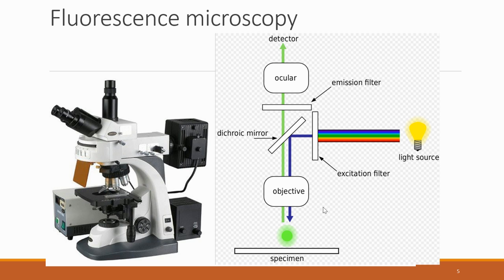There are a few things which we have to consider with this fluorescence microscope. First of all, this is an invasive method, so the sample should be stained with the color. And secondly, there is a concept called photobleaching. In photobleaching, the sample gradually loses the ability to release photons to the detector as time goes by, and if we want to record time-lapse images, we gradually lose the contrast and the intensity on the detector.